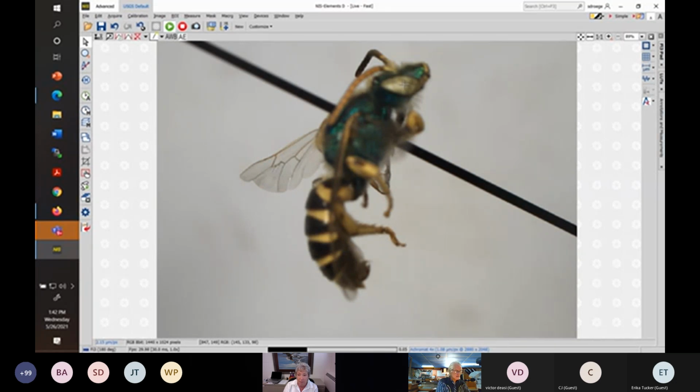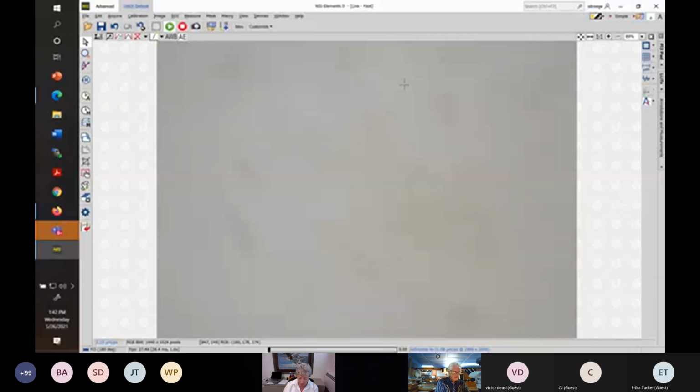And then I will take the specimen, which I will do now, and I literally hold it up, using it, backlighting it against the screen of the computer because it makes it easy to see and silhouettes the bee itself. And I'm going, okay, in my imagination, unbend that abdomen a little bit. I'm going to add a couple millimeters to that measure, and I'm going to say, oh, you know what, I would say probably that's close to 12.